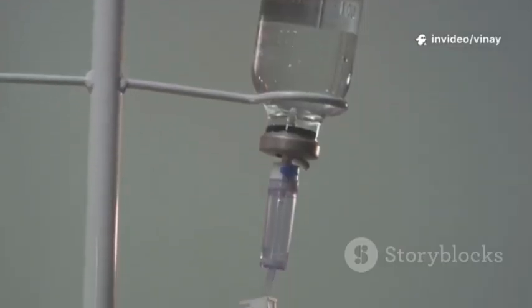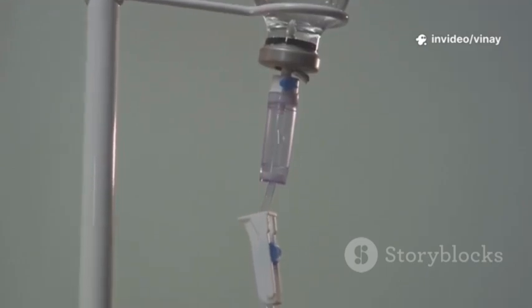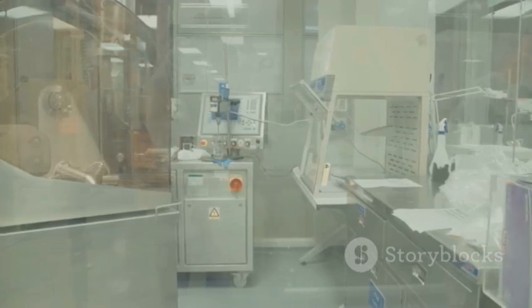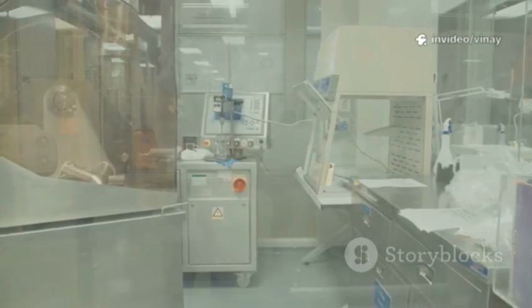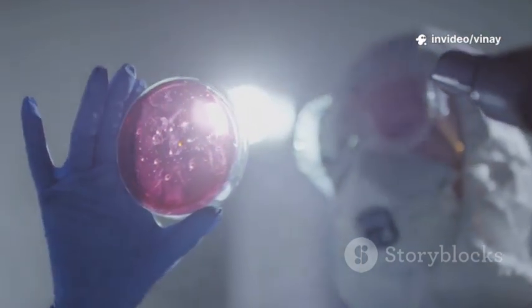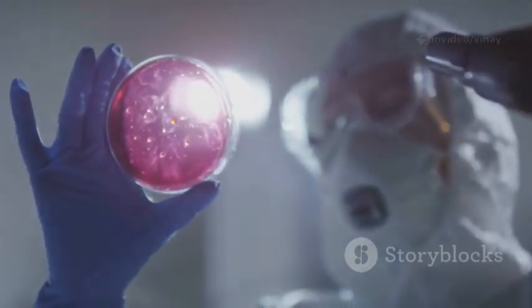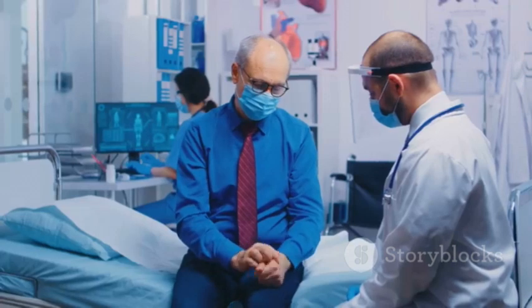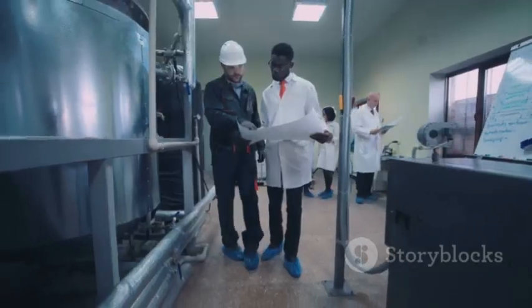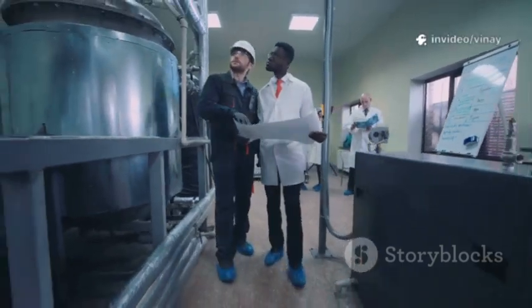Consider this. Many modern medicines, especially those given through an IV drip directly into someone's bloodstream, must be completely sterile. Sterile means they are 100% free of living germs like bacteria or fungi. If even a few of these tiny invaders get into the medicine, they could cause a serious infection in a patient who is already sick. This could make them much sicker or even be life-threatening. Filter integrity testing is the last line of defense.